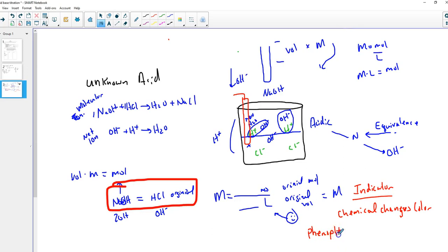You can look that word up. Phenolphthalein. Thought I had it right, it's pretty close. Now, phenolphthalein is a very potent chemical. So before you start, you're going to drop in just 1 or 2 drops. You don't need more than that.